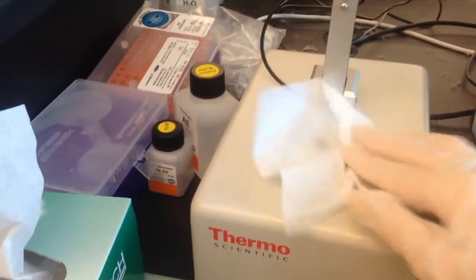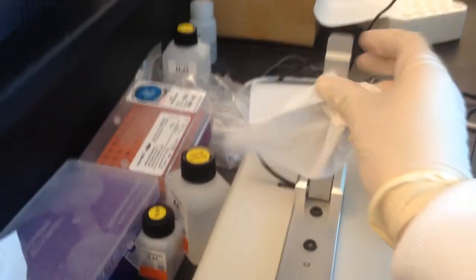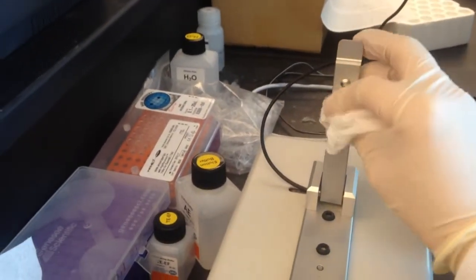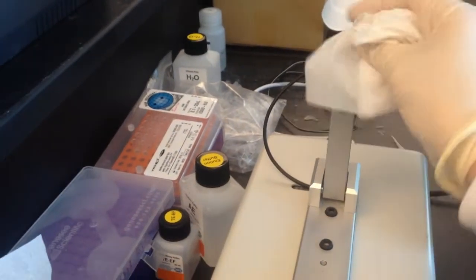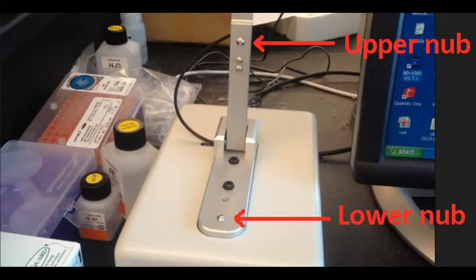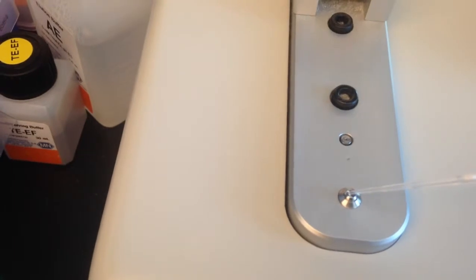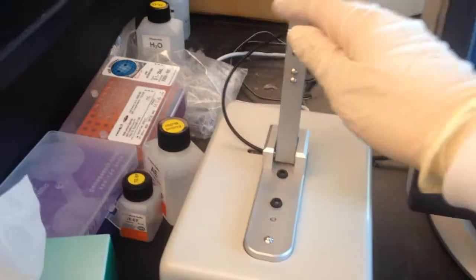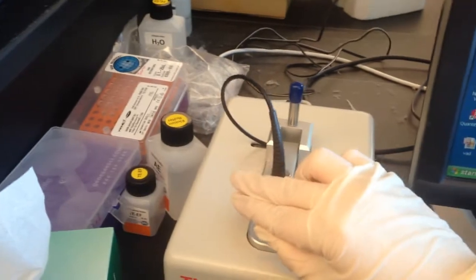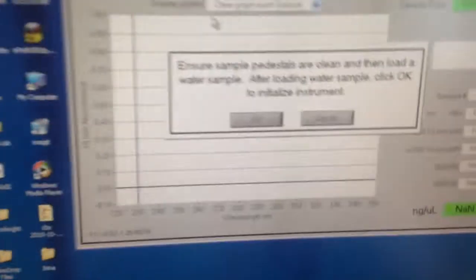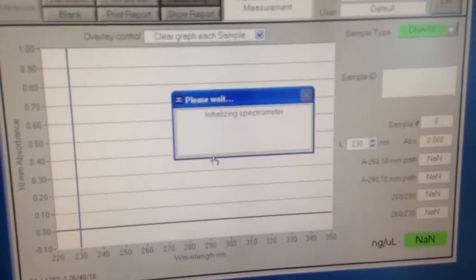Start by wiping down both the upper and lower pedestals with a Kimwipe. If you have no idea what I'm talking about when I say pedestals, it's these nubs. Load between 1 to 2 microliters of DI water. Lower the sampling arm so that the two nubs touch, and click OK on the machine to initialize.